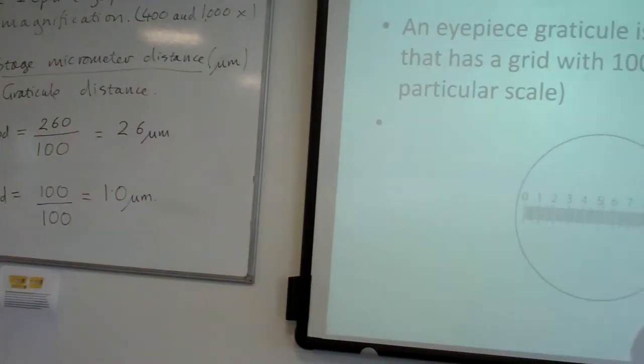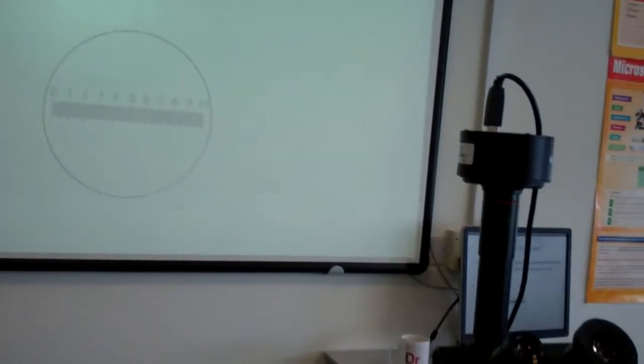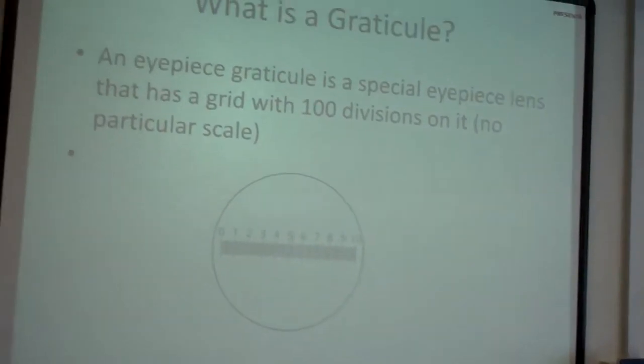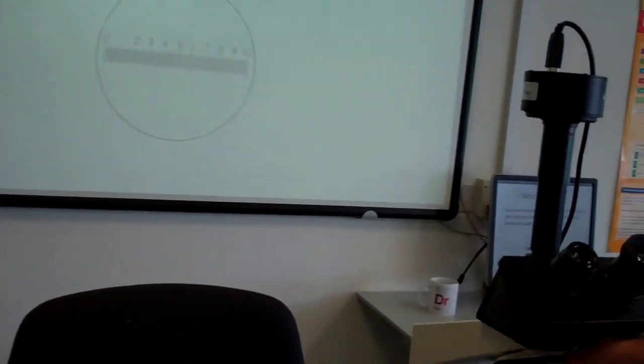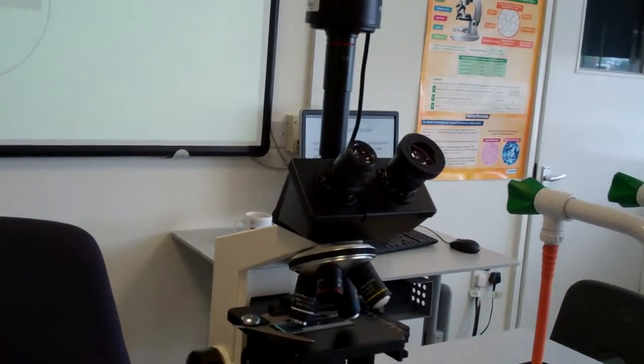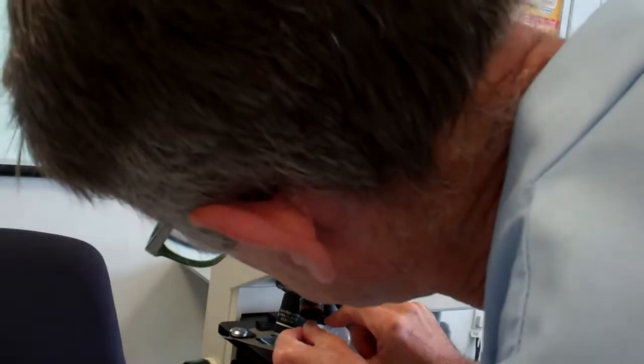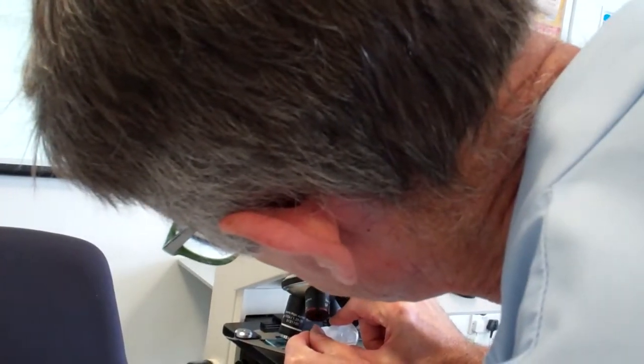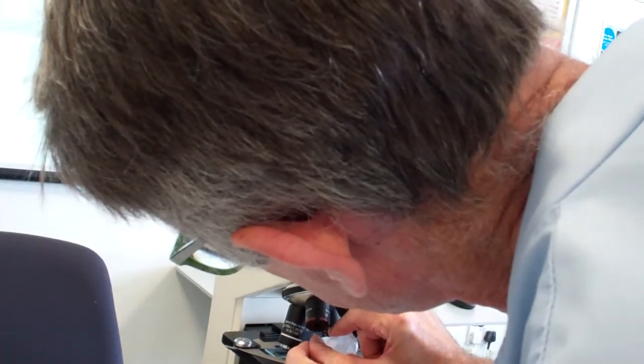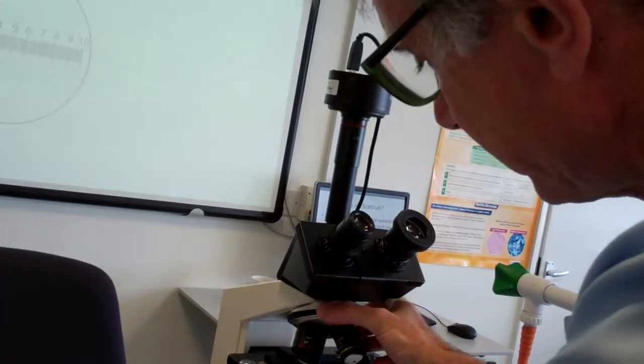Now we also need to calibrate the 1000 times magnification. Again, move your slide in so it leans to one side, add two dots of oil, and then slowly focus at 1000 times.